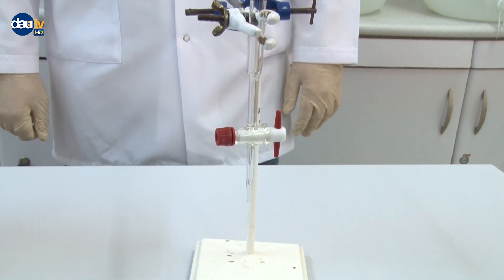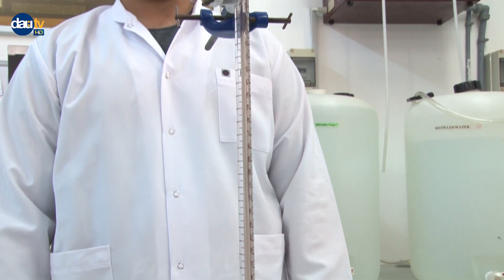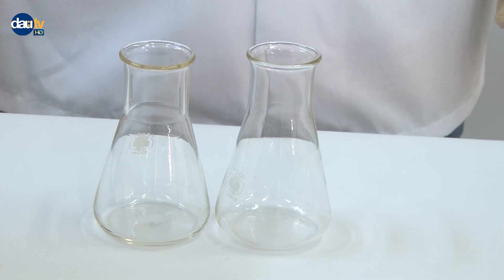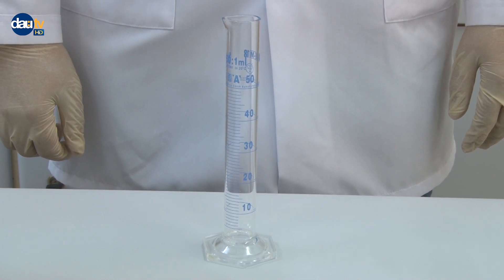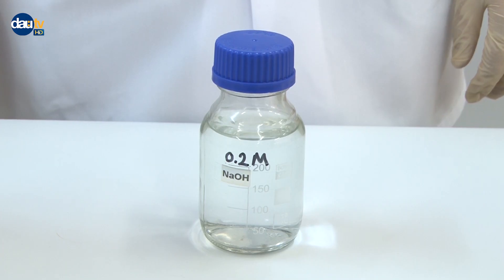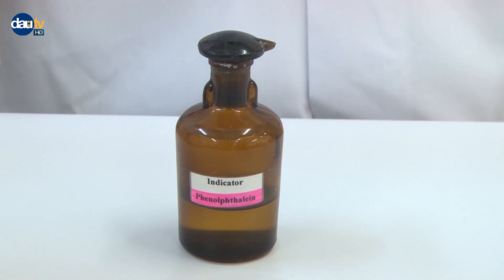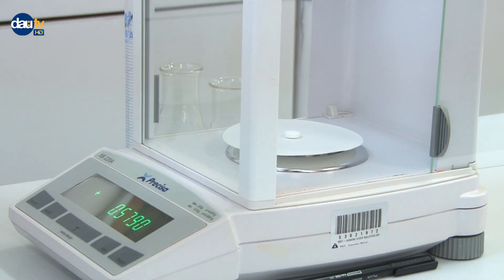Materials: 50 milliliters buret, 250 milliliters Erlenmeyer flask, graduated cylinder. Chemicals: two aspirin tablets, 50 milliliters of 50% ethanol-water solution, 0.2 molar sodium hydroxide, and phenolphthalein indicator. Procedure: Obtain a tablet of commercially available aspirin and weigh it.